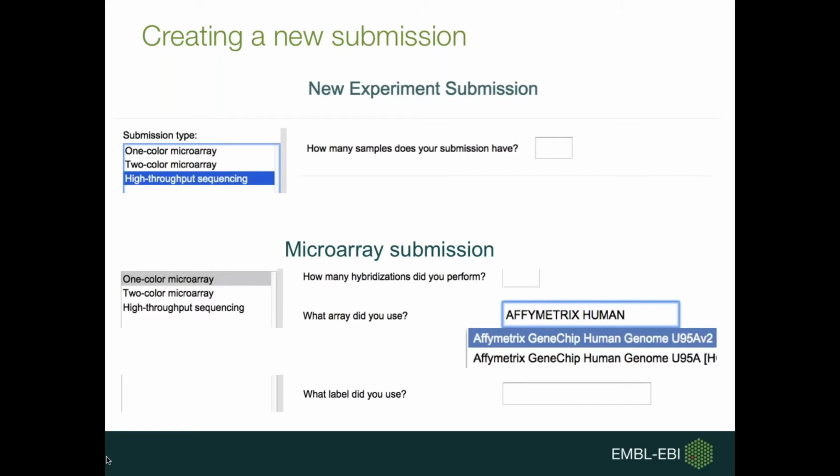And to choose the chip, you just need to start writing into the text box beside this question and choose one of the options from the pop-up window. We'll also ask you, what kind of label did you use? And these are usually Cy3, Cy5, or Biotin. And you can usually find this out by reading the protocols that you use to hybridize the samples to the array.